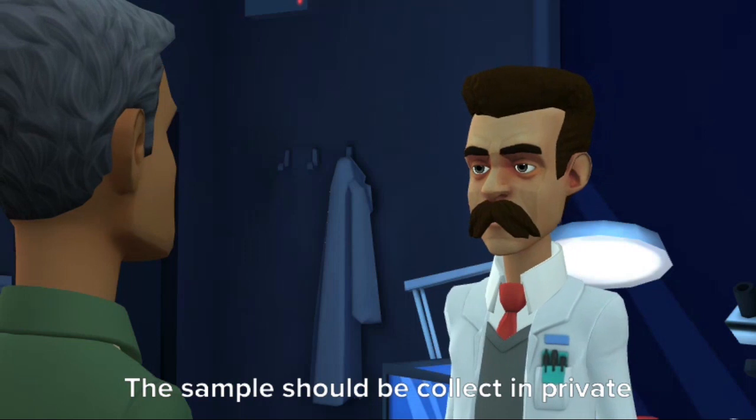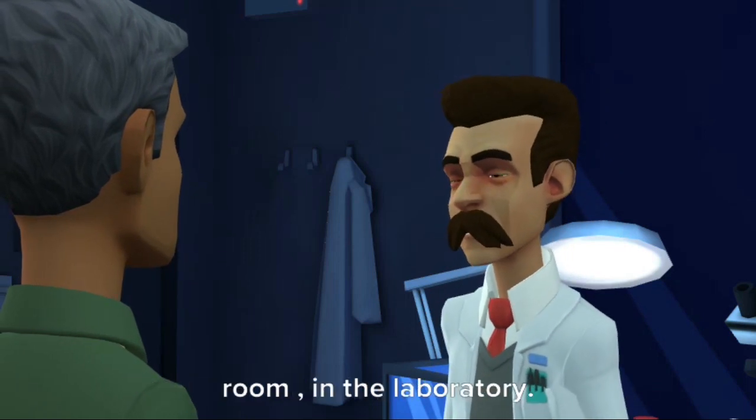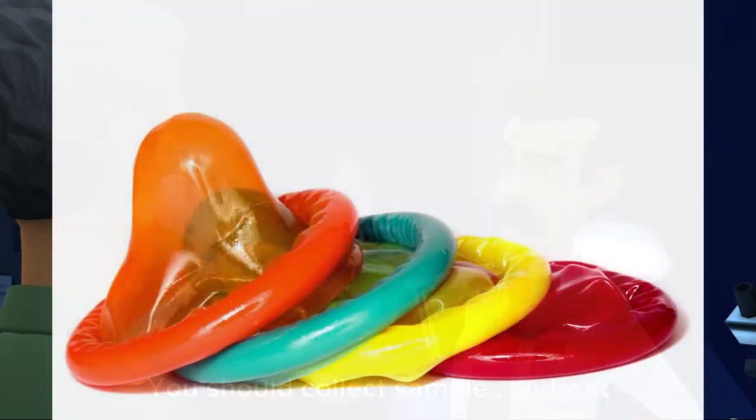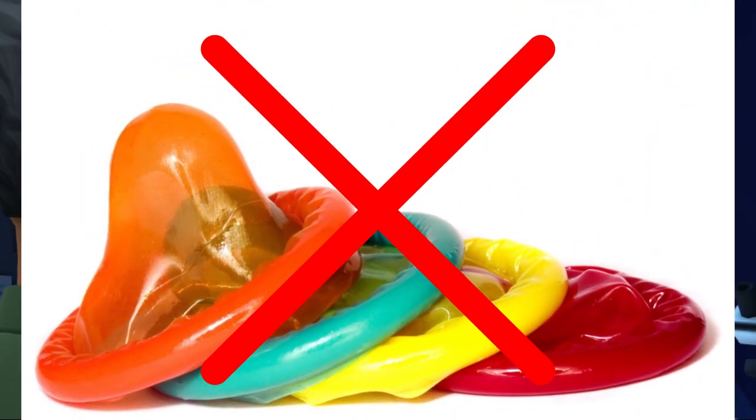The sample should be collected in a private room in the laboratory. You should collect the sample without using artificial lubricant or condoms.